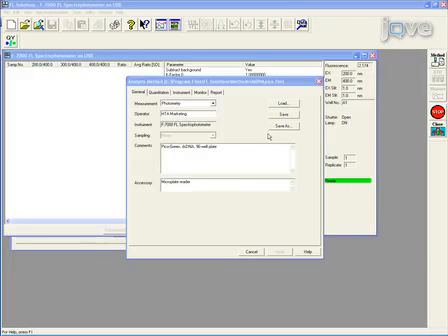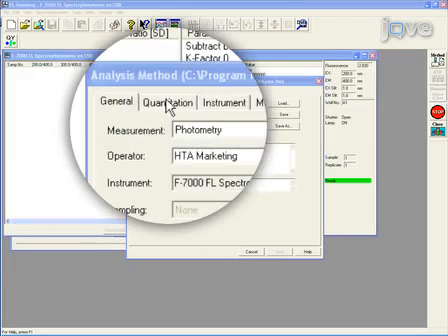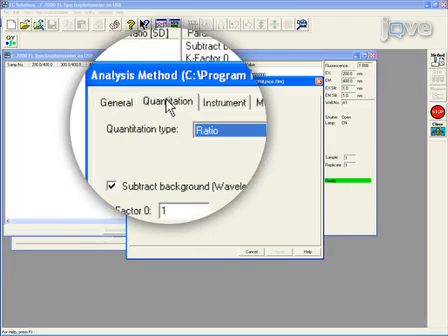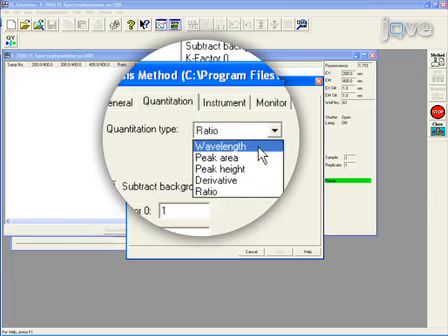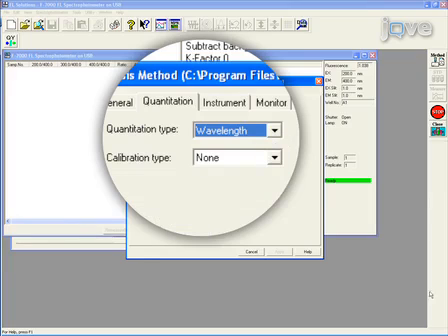Now click on the quantitation tab. In the quantitation type field, select wavelength to indicate the fluorescence reading will be made using a specified wavelength.